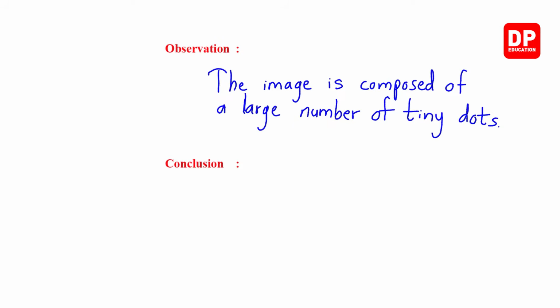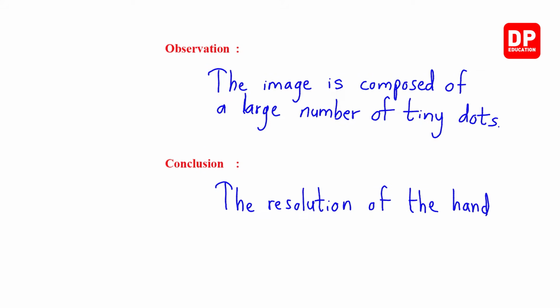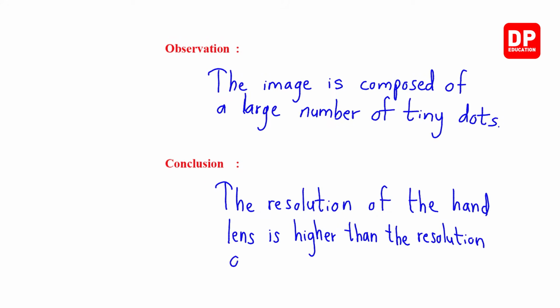Right? So the conclusion is the resolution of the hand lens is higher than the resolution of the naked eye.